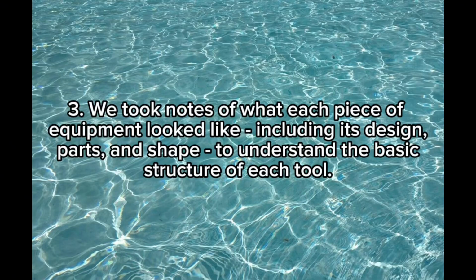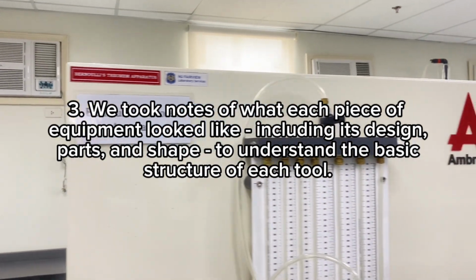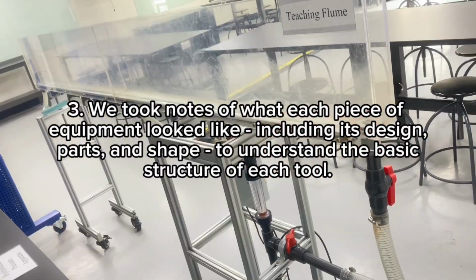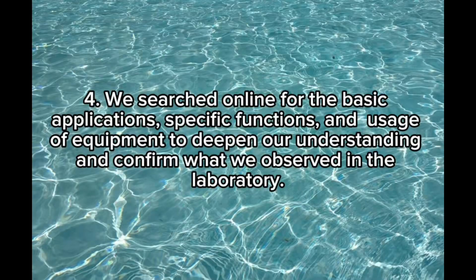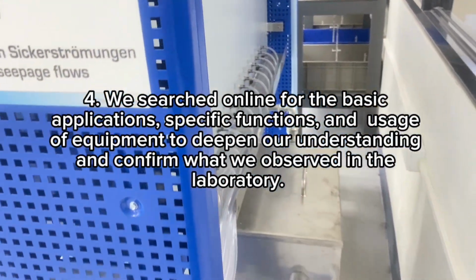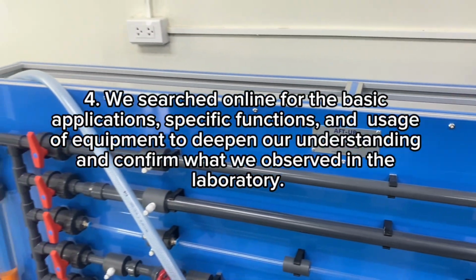Three, we took notes of what each piece of equipment looked like, including its design, parts, and shape, to understand the basic structure of each tool. Four, we searched online for the basic applications, specific functions, and usage of the equipment to deepen our understanding and confirm what we observed in the laboratory.